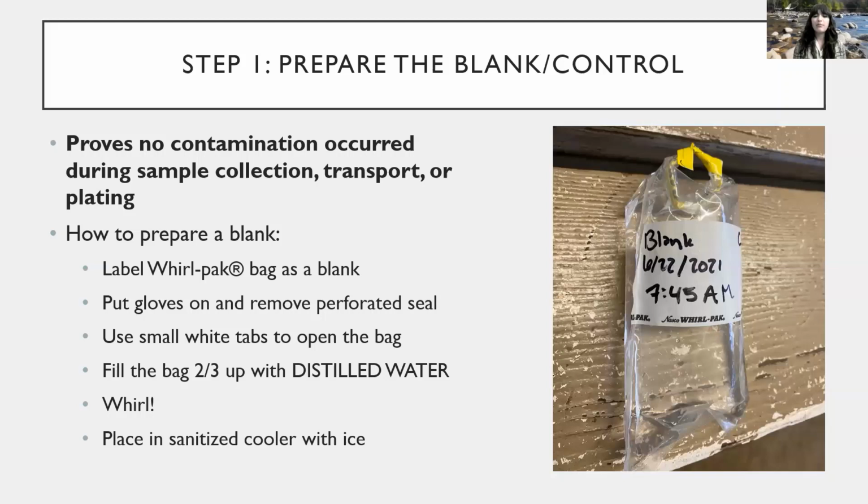And then you're going to want to put on gloves, because we want to make sure everything stays sterile. So you're going to put on your gloves to pour the distilled water into your bag. There's a perforated seal at the top of the bag that you're going to remove. And remember that this is a sterilized bag, so we don't want anything to get inside it except the distilled water. There are small white tabs on the outside at the top that you'll use to pull it open. And then you're going to fill up the bag about 2/3 of the way up with that distilled water.